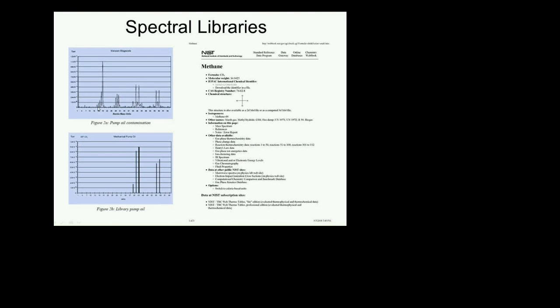A vacuum system. It's on the left side. It's a water peak right there, the typical carbon monoxide peaks and so on. But here you have these little clusters separated by 14 AMU. I looked at that and I said, this is most likely oil, right? This repetitive pattern every 14 AMU, most likely oil peaks.